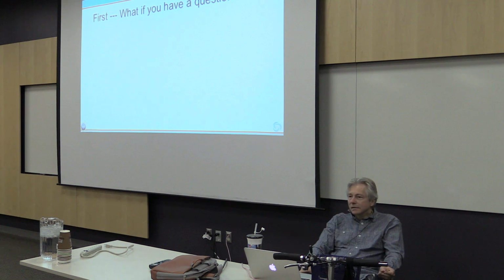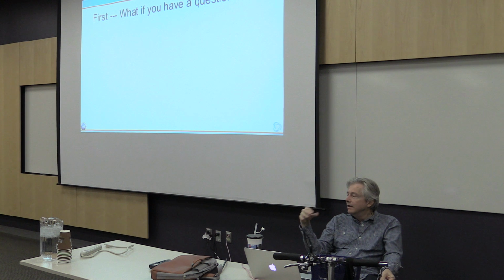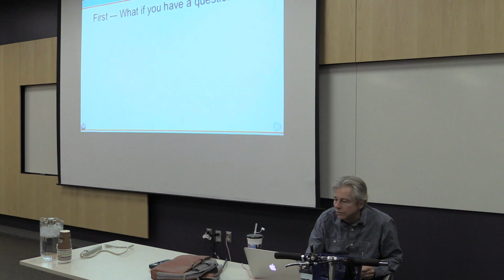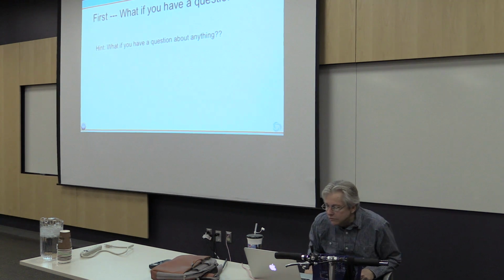If you're working with a piece of software, like we'll be using Top Hat, just put Top Hat in the search box. If you want a very in-depth definition of how to use the application, and what all the options are and what they mean, search Top Hat manual, maybe RNA-seq, just to tie it all together. But chances are it'll come up with your answer. So just keep that in mind. It's always easy to find an answer.